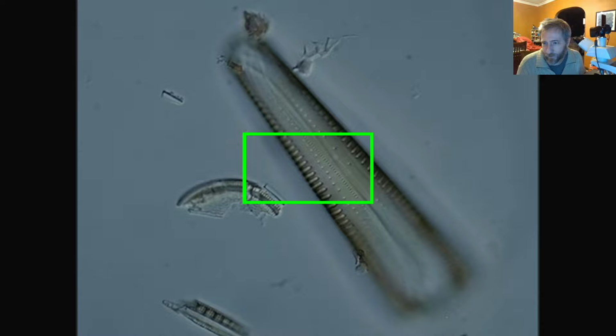Iopta says, what do diatoms attack? They don't attack anything. That's actually a bit of the joke. They're little tiny microorganisms that are beneficial to practically every case. And I made them sound like they were giant monsters from a horror movie because I think it's funny. That's just my sense of humor, I guess.